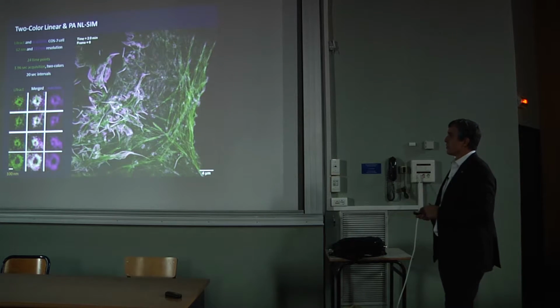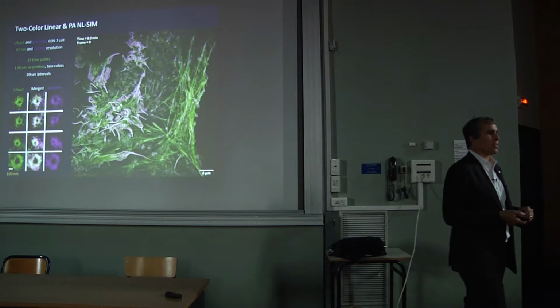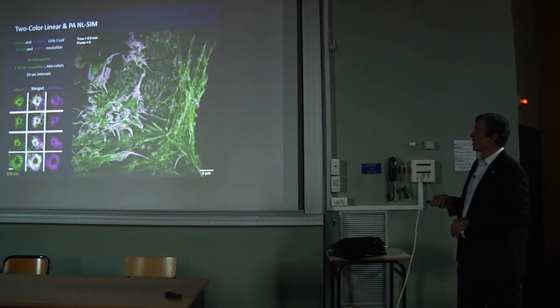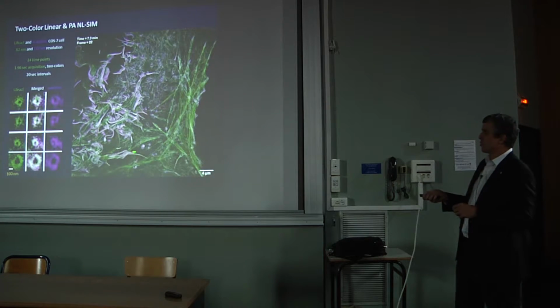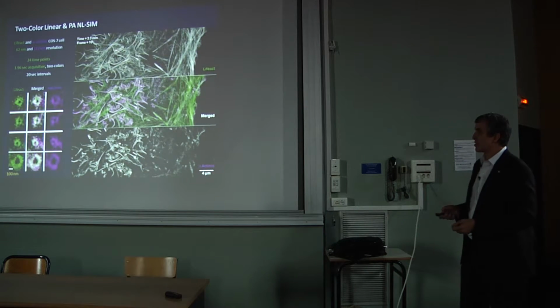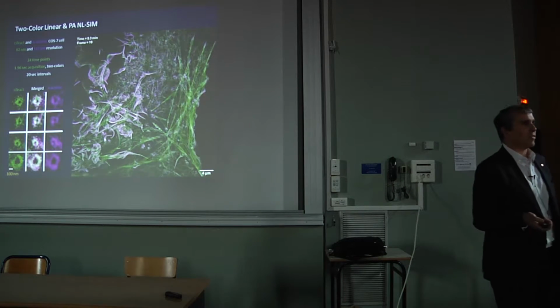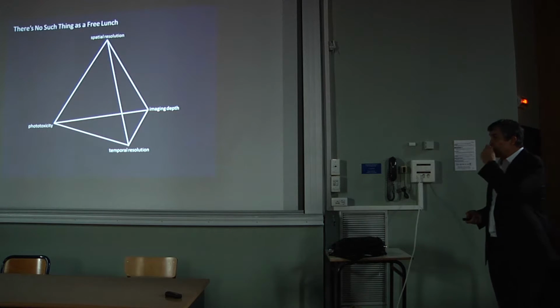So the final example of that two-color imaging is here, where we're looking at actin again, but now in conjunction with alpha-actinin, which is a protein which bundles single actin filaments together into larger stress fiber cables. And so you can see that where the cell needs these larger, stronger cables because it's trying to force out filopodia or force out a membrane ruffle, that's where the alpha-actinin is enriched. We also find, again, our old friends, the actin rings, but these actin rings are always co-localized with alpha-actinin. So they may have some role in bundling them or creating the curvature of these rings.